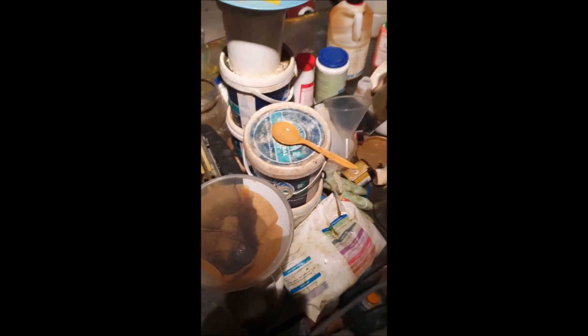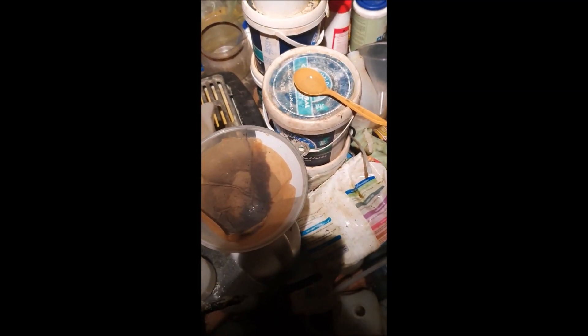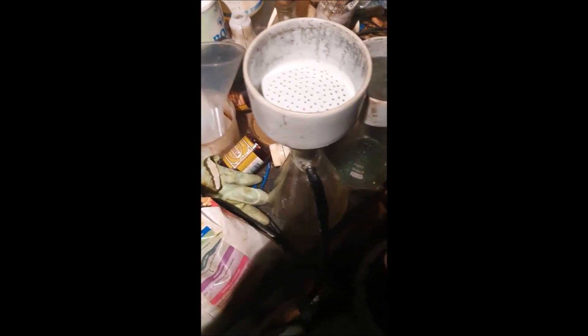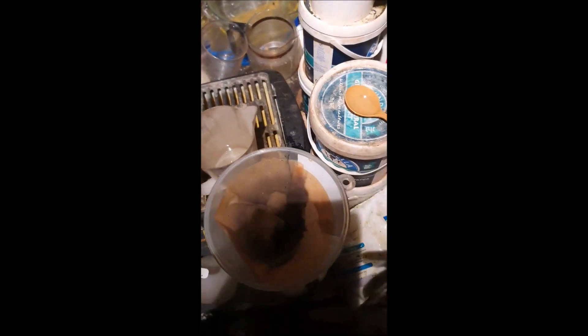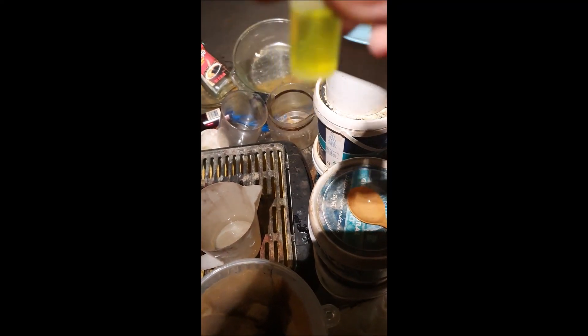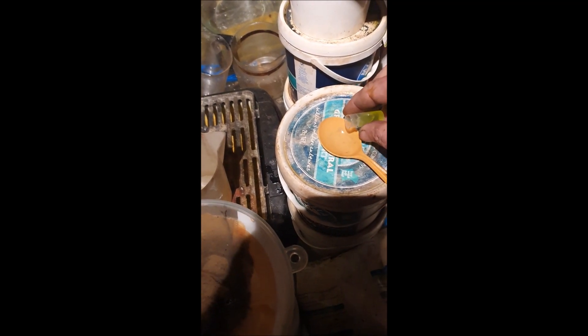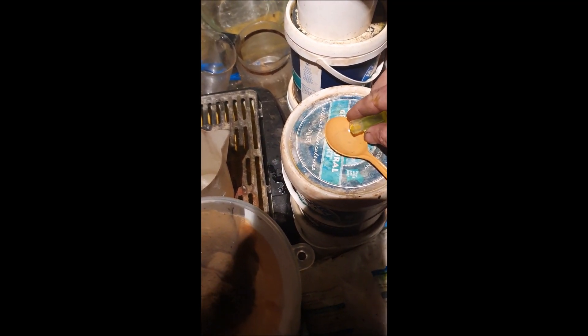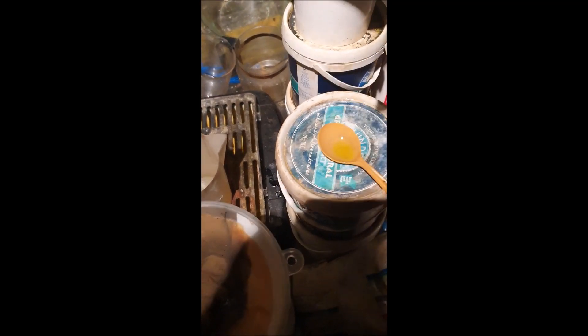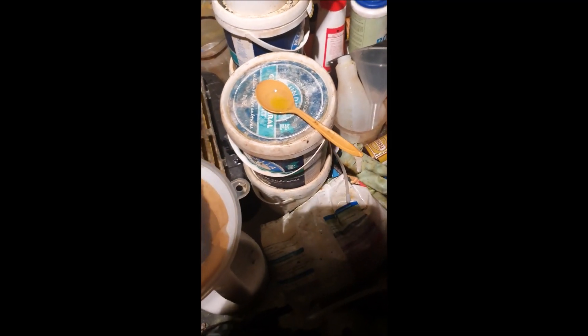I've taken the stannous chloride and poured it into this jug just to make it easy, because I've only got one hand free since I'm holding the camera. In here I have some gold solution. When I pour some in — I can't find my pipette, otherwise I would just put a drop or two.